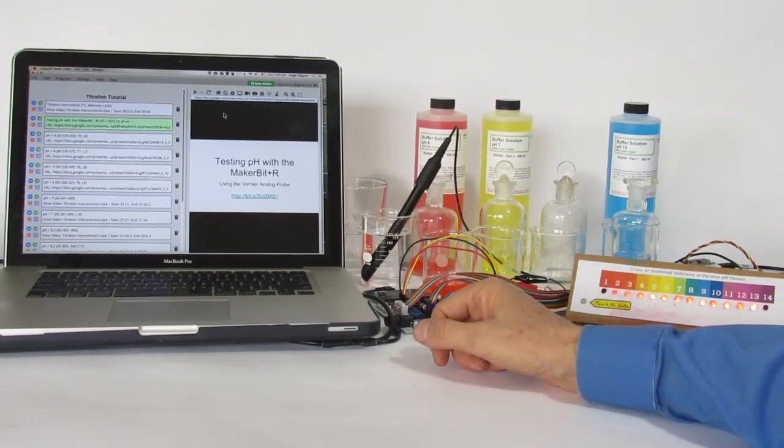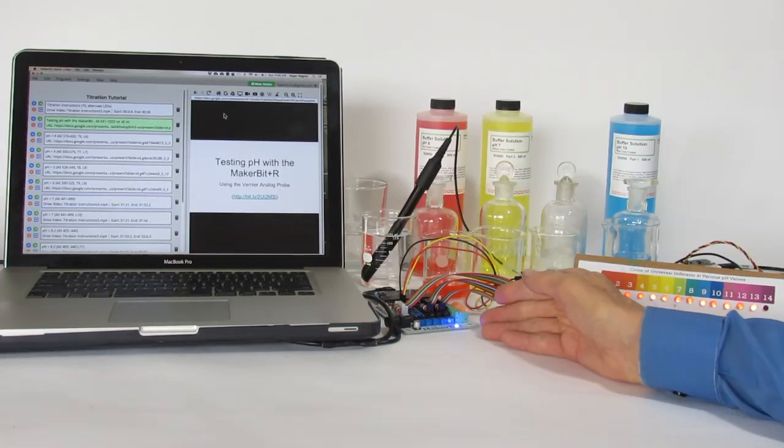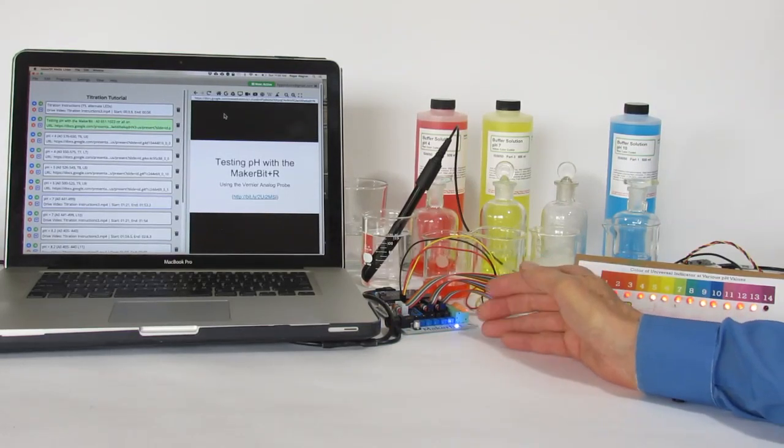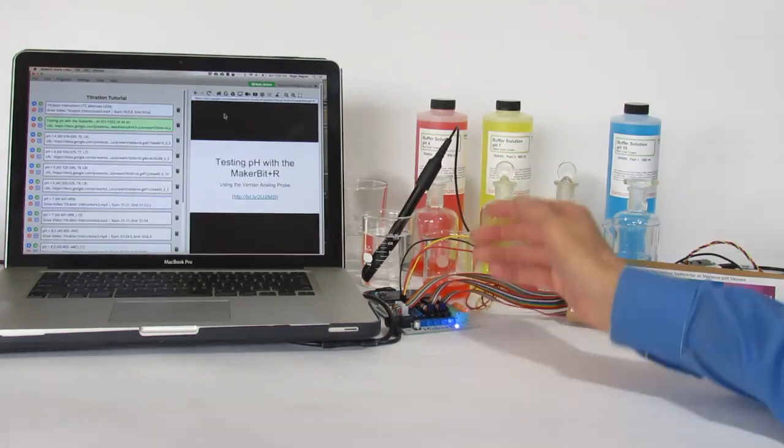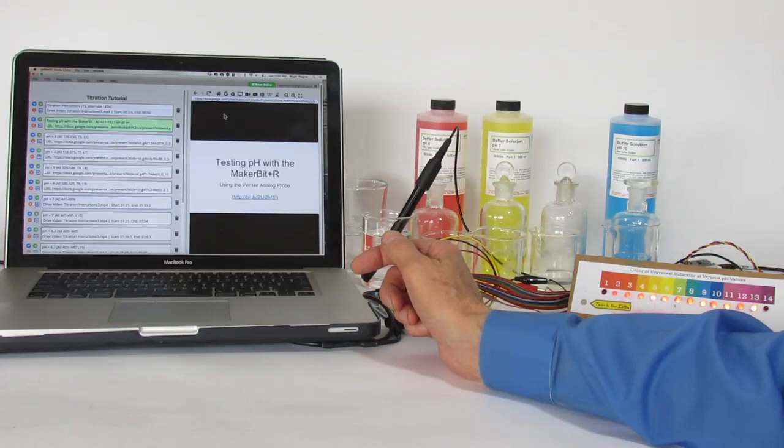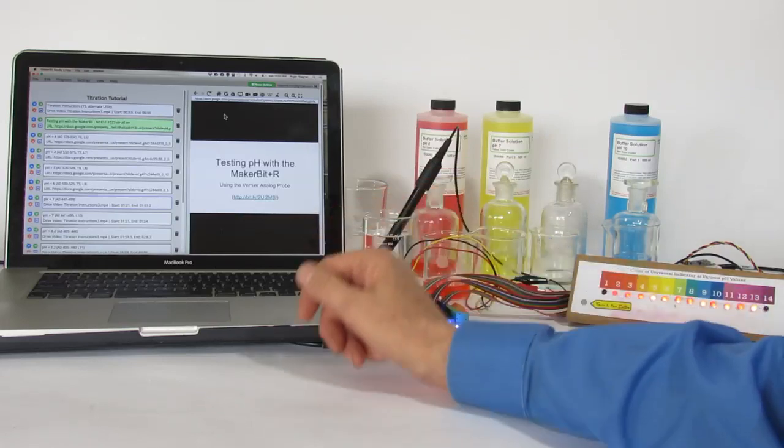Hi, this is Roger Wagner and in this video we're going to look at a demonstration of using the MakerBit along with the Vernier pH probe to look at real-time pH values. Using the MakerBit media linker we can associate any particular pH value with digital media.